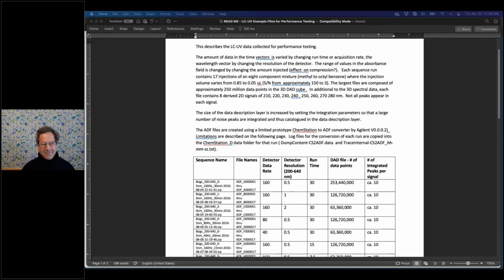I am Srikant Sarangi. I work as a pre-sales engineer with Zach, and what I would like to show is how SciDB works with the Allotrope data format. SciDB, as Zach showed in the presentation, is a computational engine under the Reveal Analytical Development application.